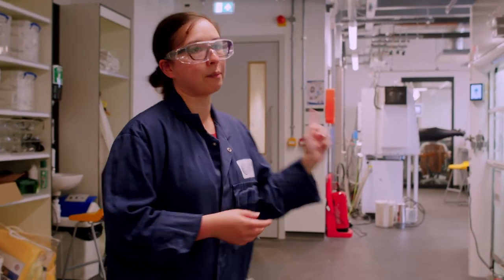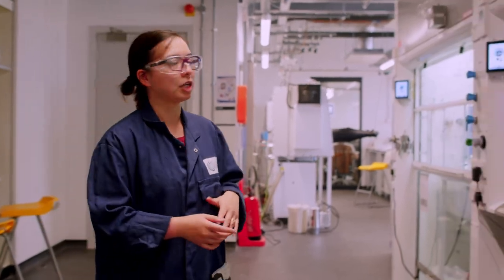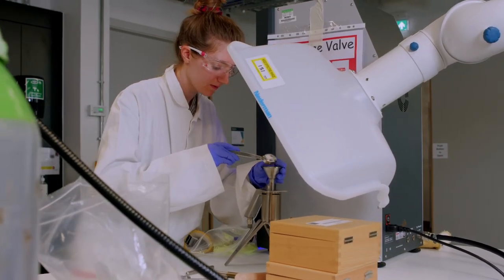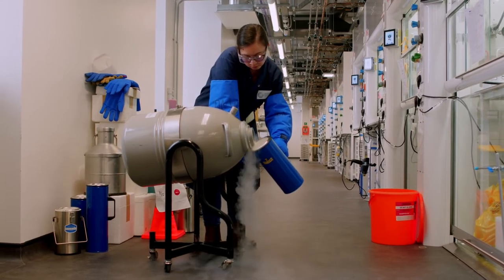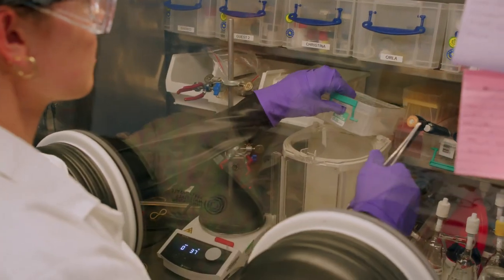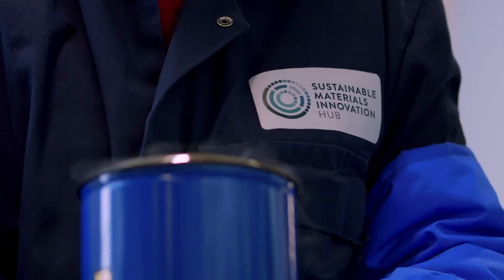What's nice about the three labs together is that anything that we learn in the end of life lab gets fed through to synthesis and synthesis into end of life, also the instrument lab as well. So the labs are all talking to each other and all the findings help us improve our science. So I hope that walk around is giving you an idea about the capability of the Sustainable Materials Innovation Hub.